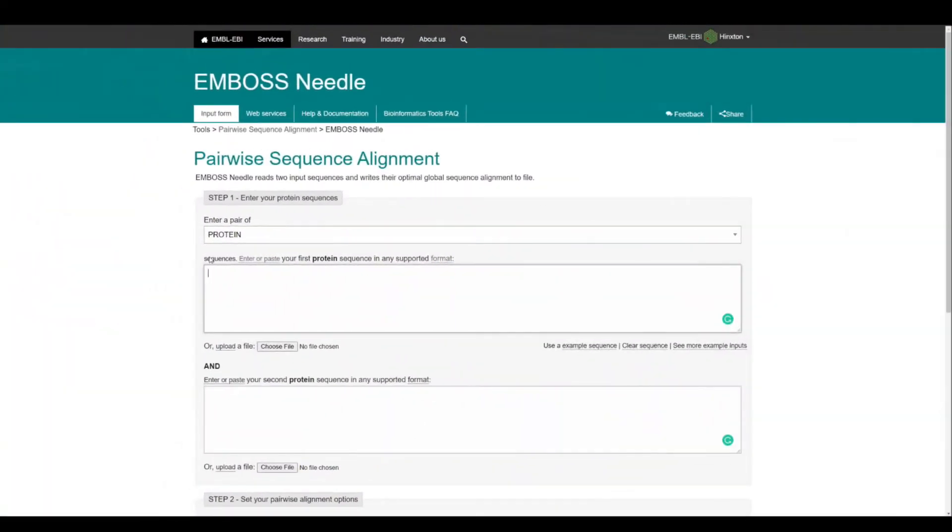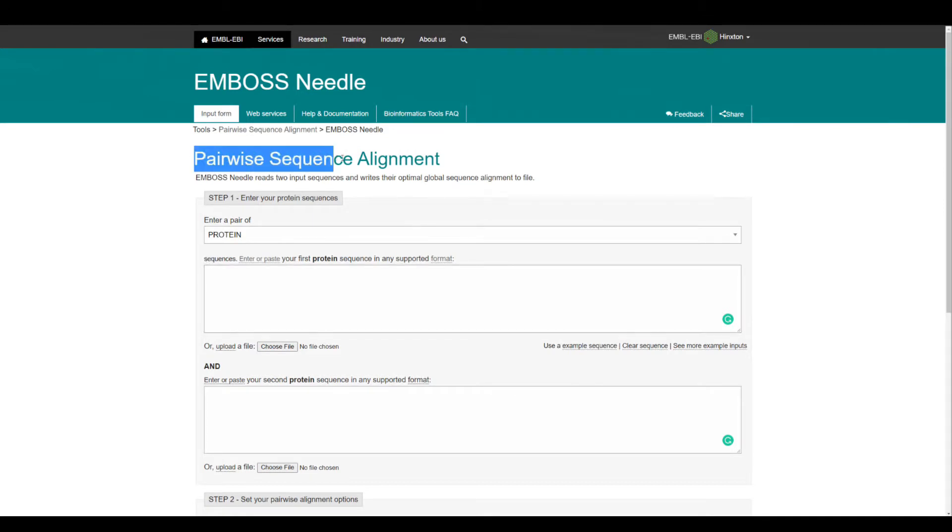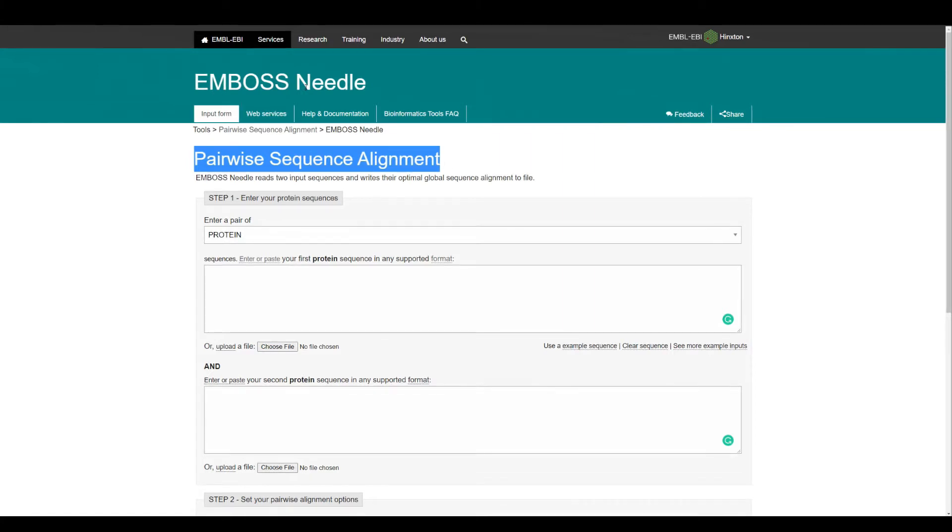Hi everyone, welcome to Basic Science Series. I'm your host Lakin Akumar, and today we're going to do pairwise sequence alignment using EMBOSS Needle software.